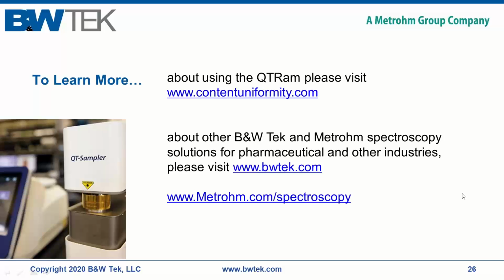Lovely, thank you. Catherine, another question that we've had in, if we have two software, are both of these 21 CFR Part 11 compliant? The BW Analyst software is 21 CFR Part 11 compliant.